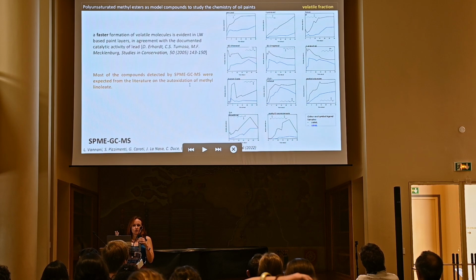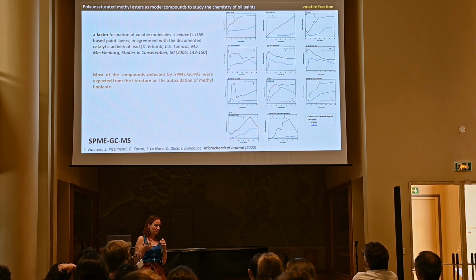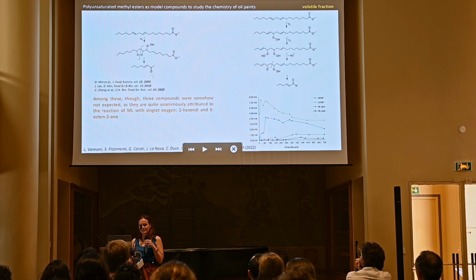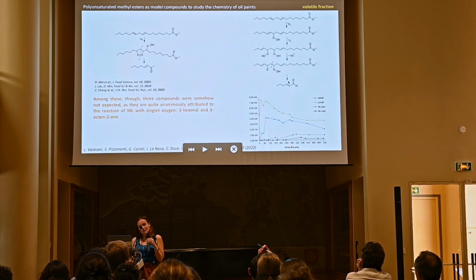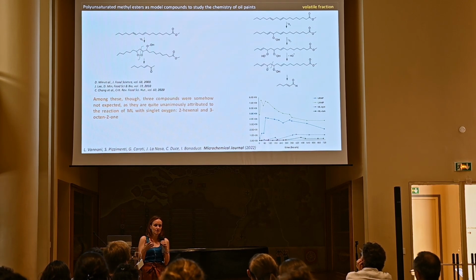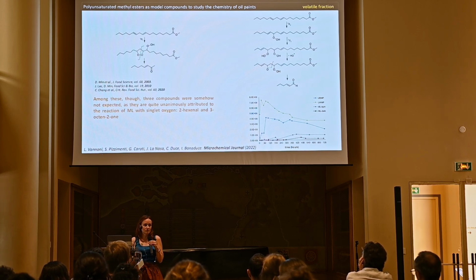And the majority of the molecules that we could identify were expected by auto-oxidation of methyl linoleate. But we were quite surprised to find these 2 guys here because they are products of oxidation with singlet oxygen and not triplet oxygen, which is the ground state oxygen. We saw something in the literature about ultramarine blue, which is hypothesized to be a photosensitizer in some cases, and so favoring the conversion of oxygen from triplet to singlet, but nothing for lead white.